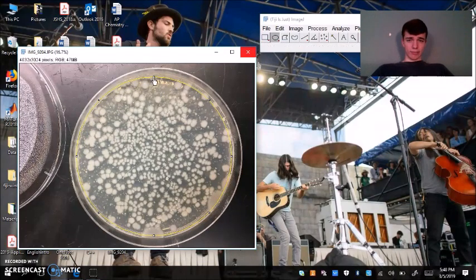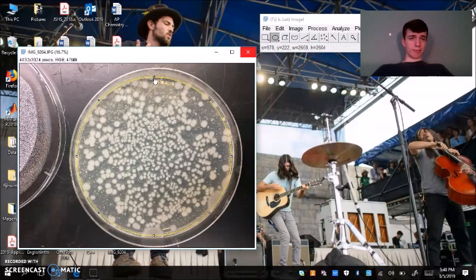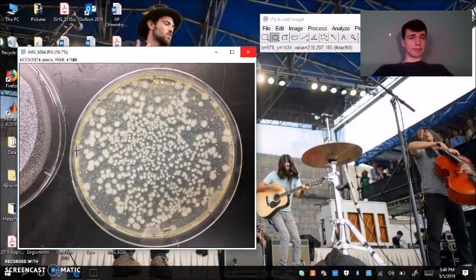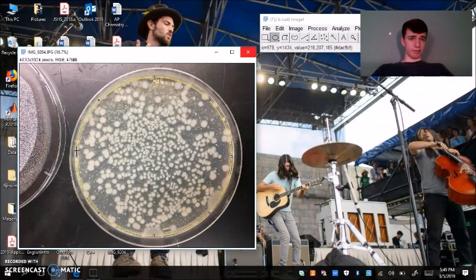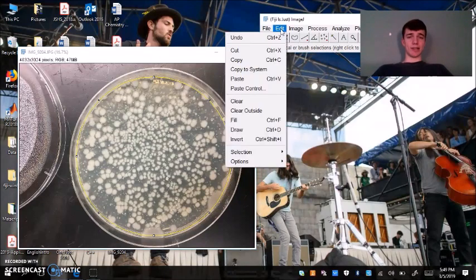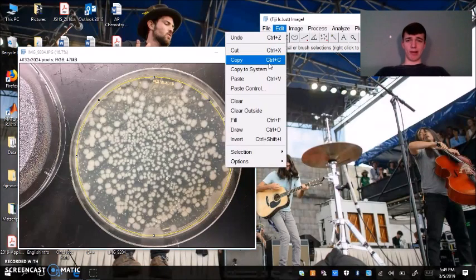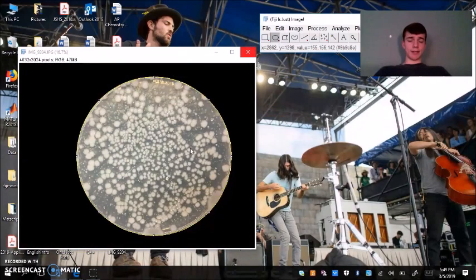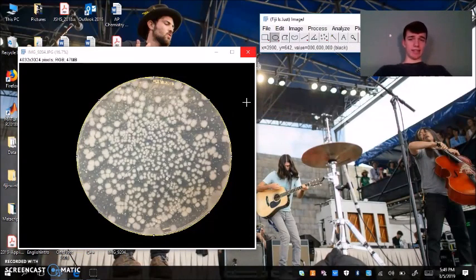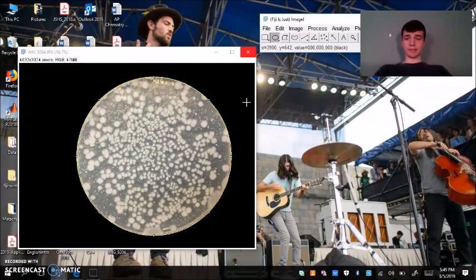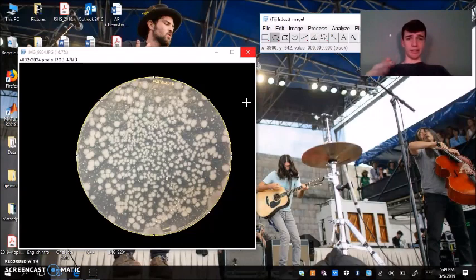Just a tip for later, I would do your best to exclude the edges because sometimes ImageJ can count those as colonies and we don't want that happening. You're going to go to your edit dropdown bar, clear outside, and that's going to make everything outside of your circle that you just created black. So we're just focusing on our colonies here.